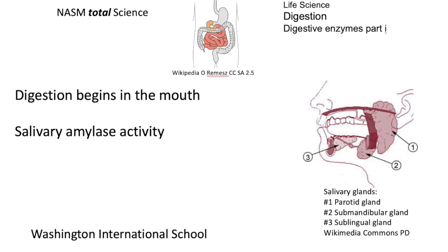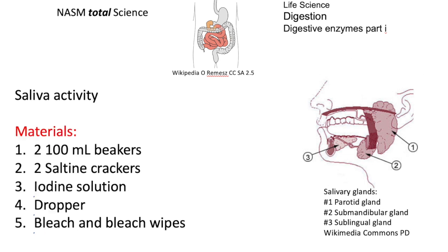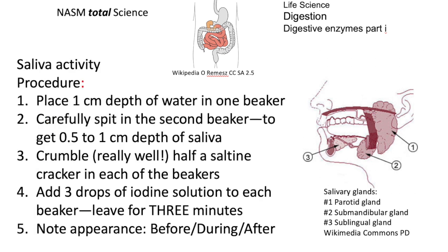And so, salivary amylase activity and your safety: keep the saliva inside the beaker, dispose of it very carefully with bleach, and clean your lab bench well. And here are the materials that you will use. We're going to use saltine crackers and iodine solution for testing.